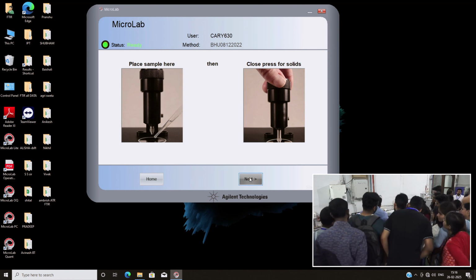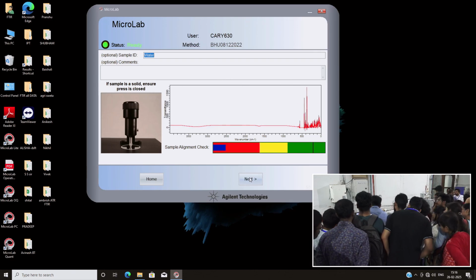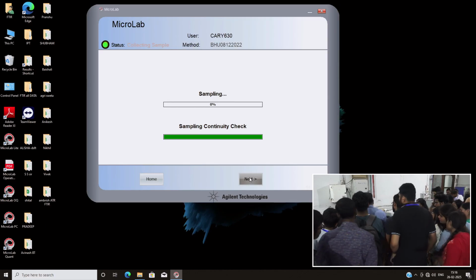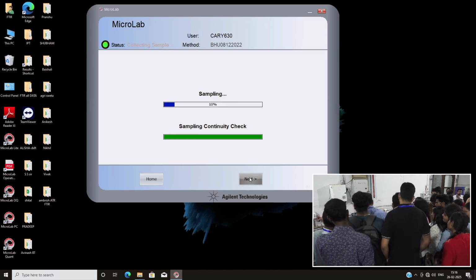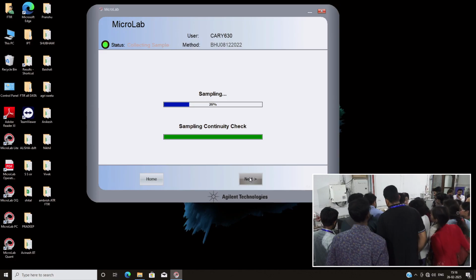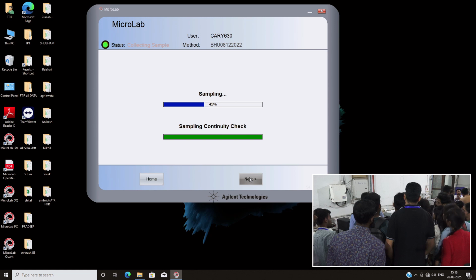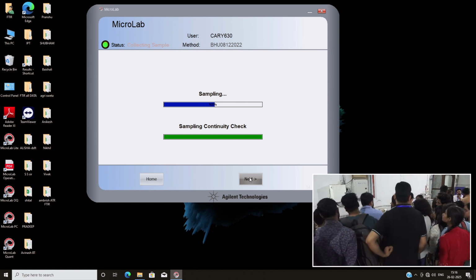Then the measurement of the solvent spectrum starts. In this case, the solvent is water, so we can expect 3 peaks, 2 OH stretching and 1 OH bending. Okay, and please realize there are 3 peaks.